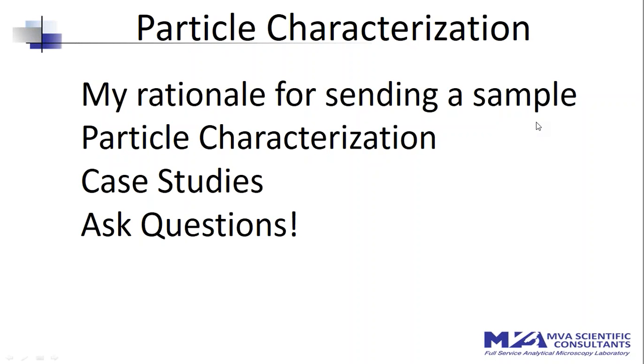If everyone can see my screen, our outline for today is: I'll talk a little bit about my rationale for sending a sample out to another laboratory. I'll talk about particle characterization and the complementary techniques that I use here at MVA. I'll talk about a few case studies, and then we'll have some time at the end for people to ask questions, which is your time to really try to stump me.